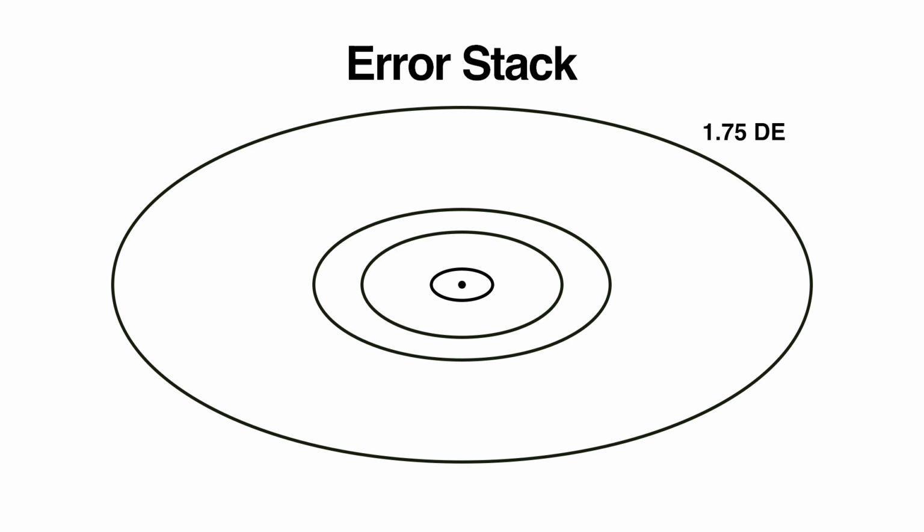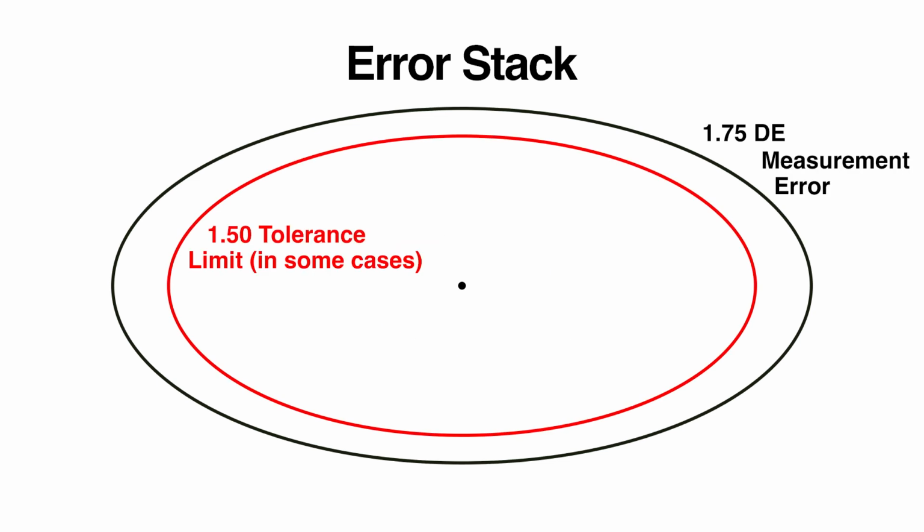This is assuming that we are using brand new standards that have not aged. If they have aged several months or more, this variation will be even greater. In some cases, this means that the sampling error for the standard is as great as, or even more than, the allowable production tolerance.